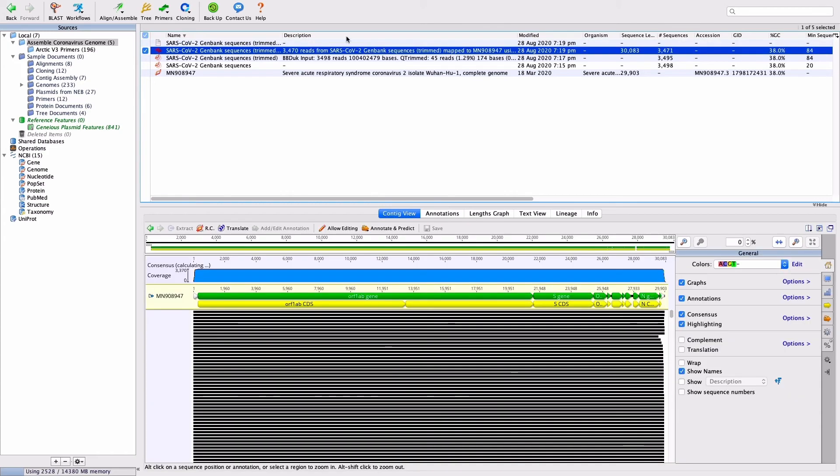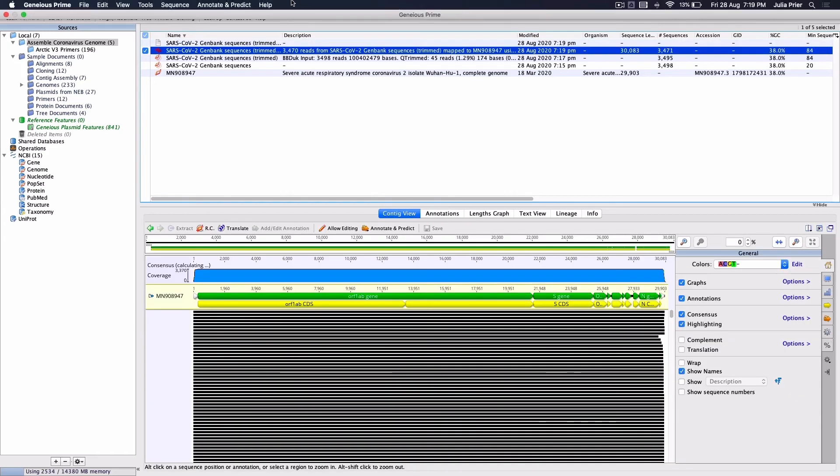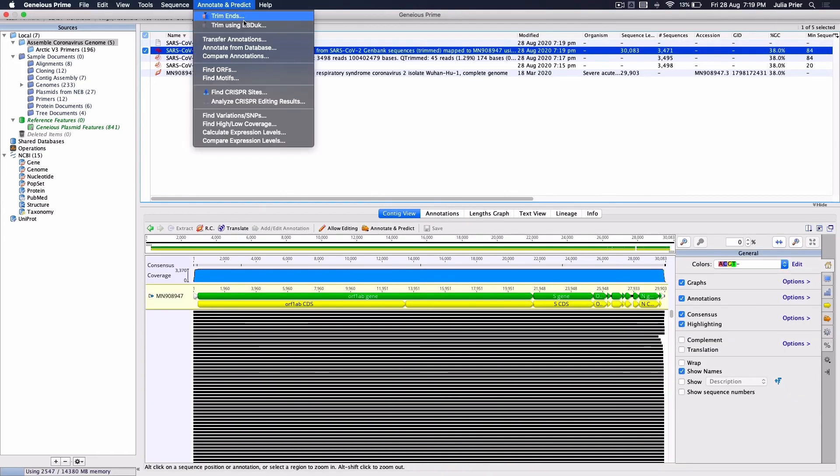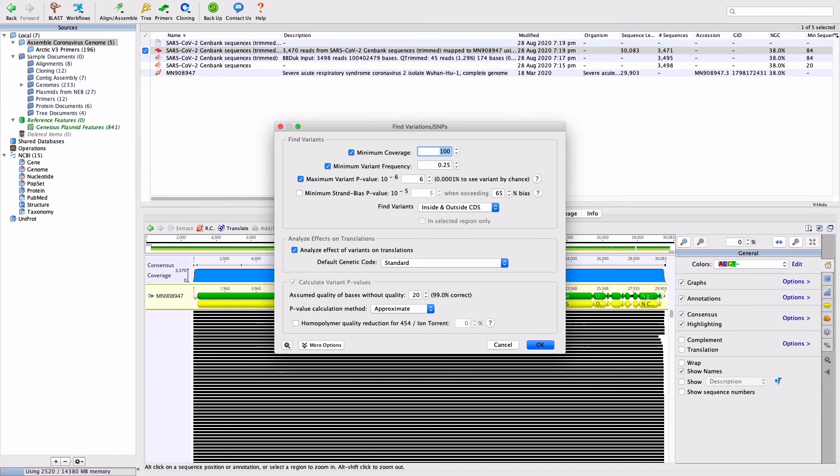To call variants, select the contig assembly document produced by Map to Reference and go to Annotate and Predict and find variations and SNPs. Set the minimum coverage to 100 and turn off Strand Bias p-value.